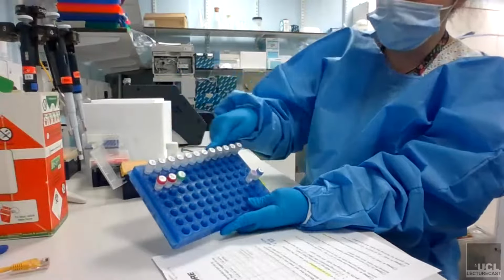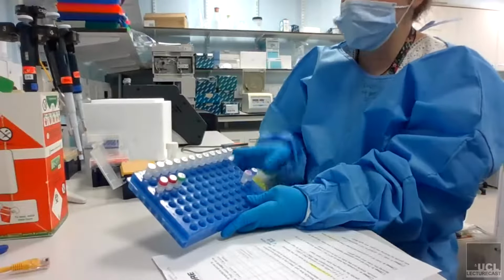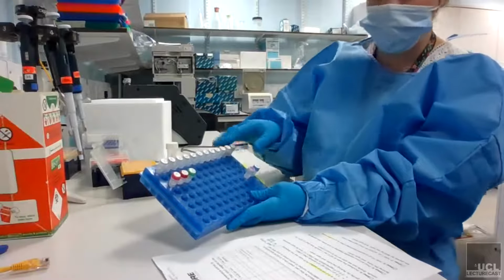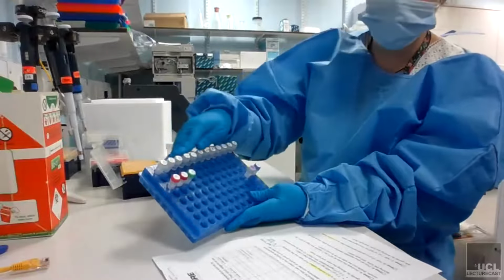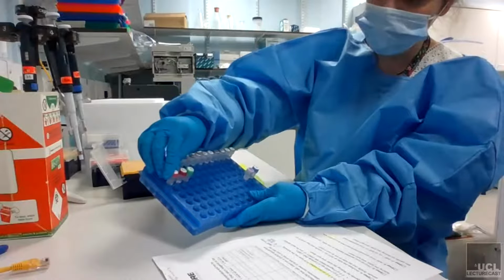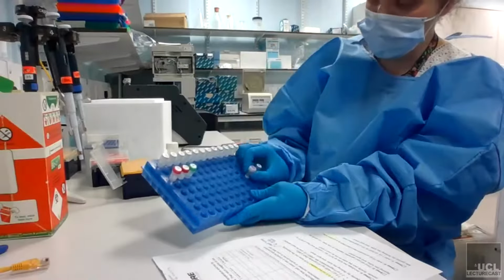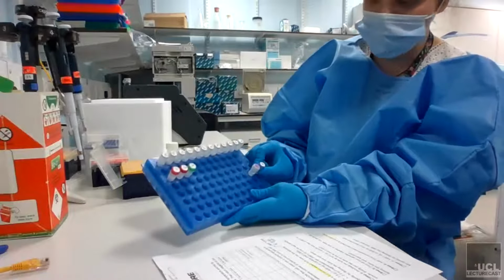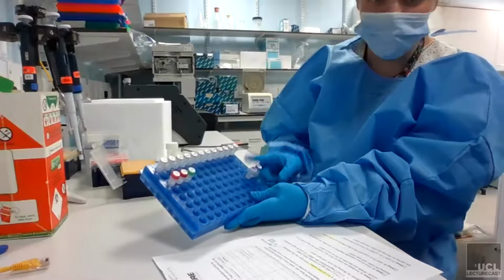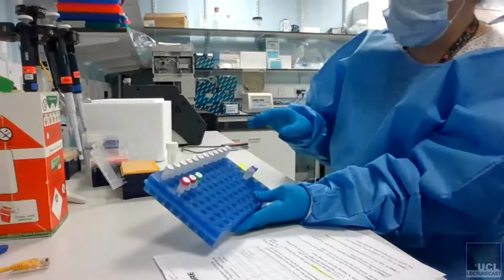What we've got is the various barcodes. There are 12 different barcodes, so you can have 12 different samples running on one flow cell. Today, I'm just going to pretend to do 5, so we're only going to use the first 5. Then we've got the other reagents: loading beads, sequencing buffer, the rapid adapter, and then flush tether and flush buffer that we're going to use to prepare the flow cell, which we've already done. I showed you in another video, but we'll go through it anyway.